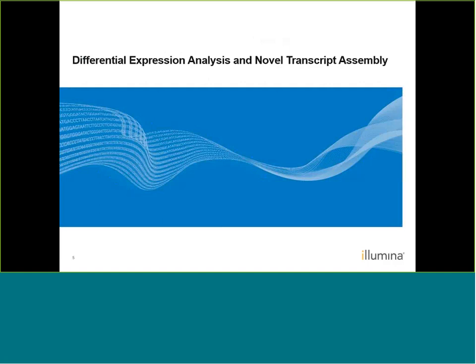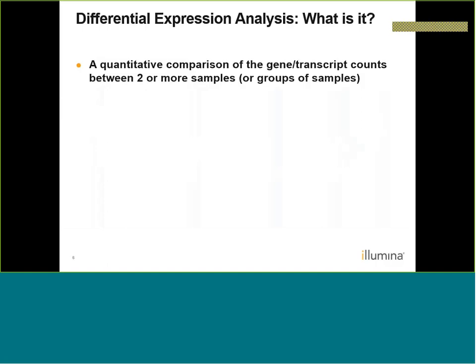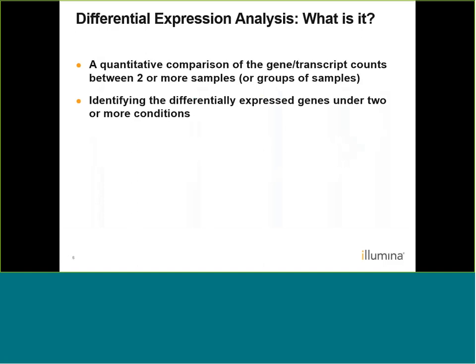Okay, so let's kick off by defining differential expression analysis and novel transcript assembly. So, differential expression analysis, what is this? You can think of it as a quantitative comparison of the gene or transcript counts between 2 or more samples or groups of samples. It's a way of identifying the genes that are differentially expressed under 2 or more different experimental conditions.